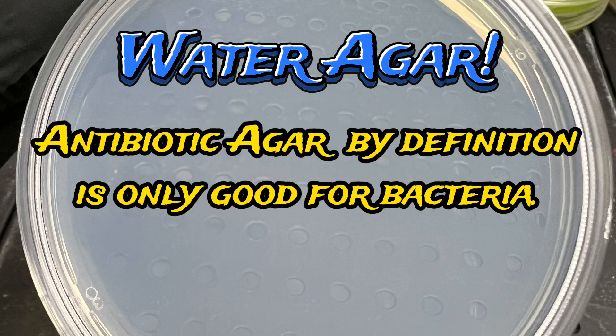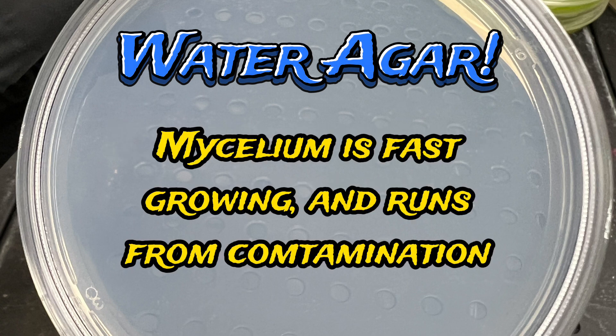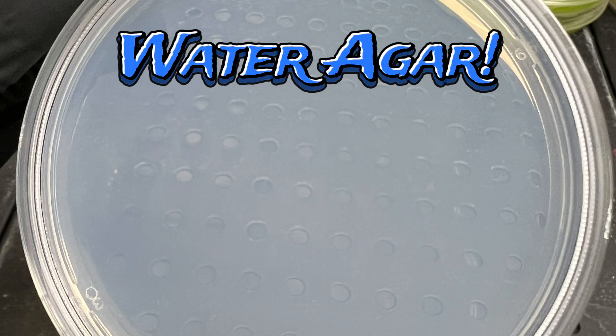Why? Well, antibiotic agar by definition is only good for bacteria. Bacteria is very slow and likes food. Mycelium is fast and runs away from contamination. So when we use water agar, the bacteria likes to stay near the transfer and the mycelium likes to run away.